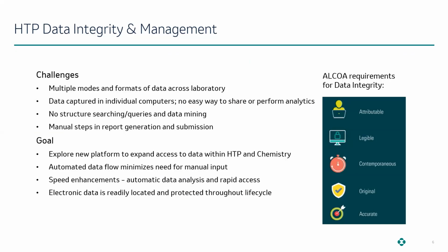While we know where our data exists on laboratory computers, the challenge remains access to others, specifically discovery chemistry or other analytical groups across the network. So data mining and automatic report generation on a more universal system where users don't really need to worry about where their data resides is helpful to both high-throughput purification as well as chemistry.